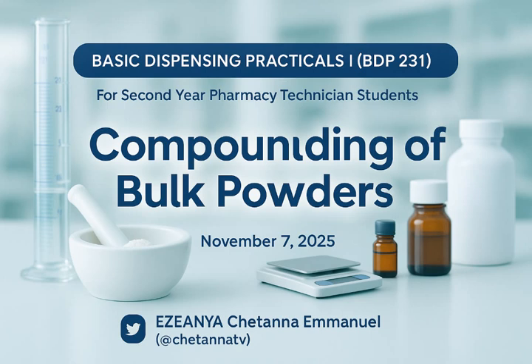You see here zinc oxide 250 gram, starch 250 gram, purified talc 500 gram, right? Good. What it means is that if you want to get the total weight of the products you have, it will be what? It should be what?